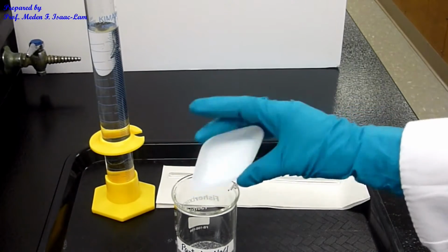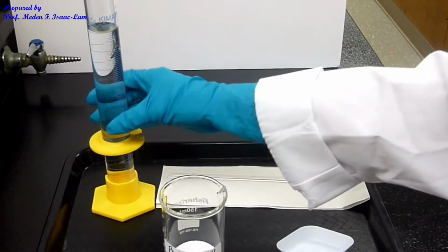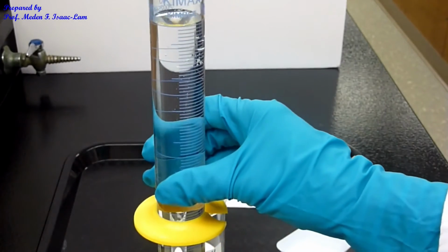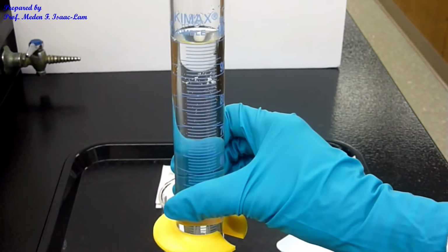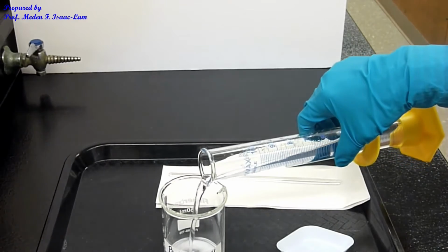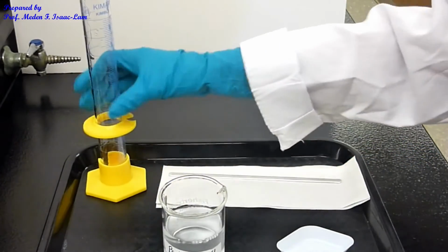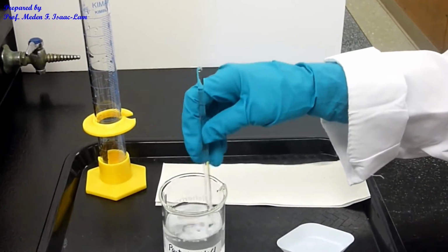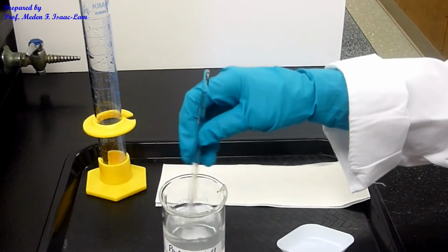So we're preparing a solution, and I labeled that as part A, NaCl, and this is now the water. I measured with a graduated cylinder exactly 100 ml, 100.0 ml, and I'm just going to pour it into the beaker, and then stir it using a glass stir rod to dissolve. It will dissolve fast.